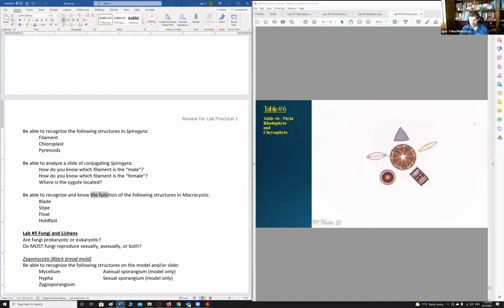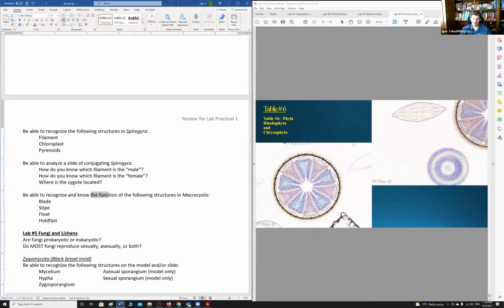Diatoms are made out of two parts, the shell is made out of two parts, hence the name. Di means two. And the shell is transparent, made out of silica, silicon dioxide, essentially glass. And they come in very intricate forms. They might have a radial symmetry, all kinds of neat stuff right there, but we're not going too deep into that.